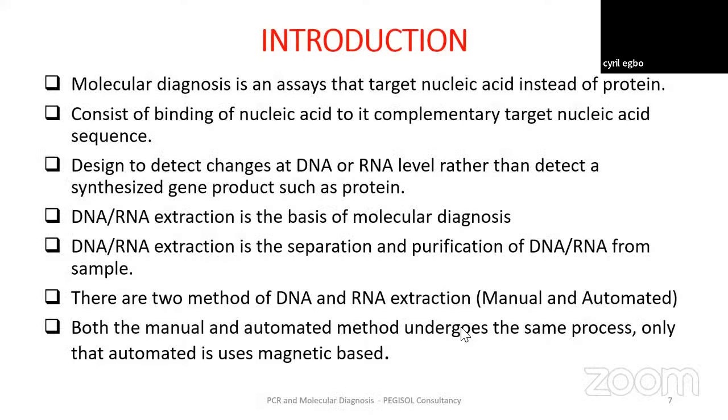So I just want to throw more light on this molecular diagnosis. Number one, molecular diagnosis actually targets the nucleic acid instead of the protein, because proteins are the byproduct of these genetic materials.